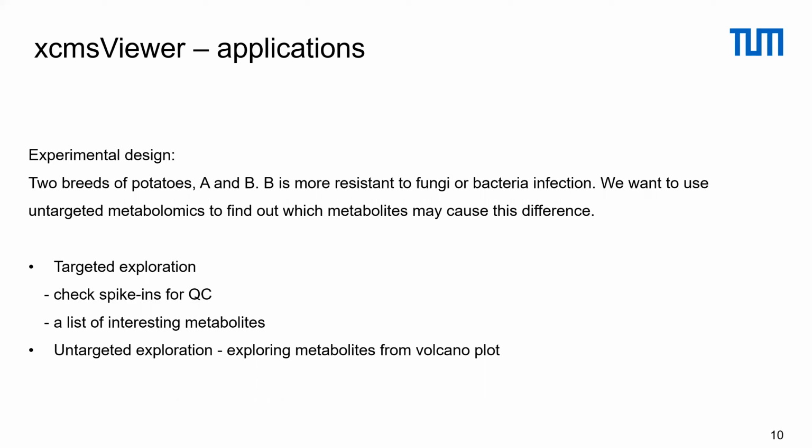This example is from our collaborator, but the biology I show here is not important because the data is unpublished. I don't show the most interesting biological results here. So we will do two things. One thing is targeted exploration. The other one is untargeted exploration.